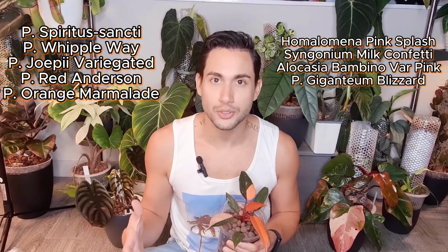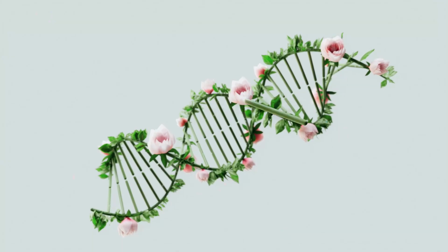In this video, I'm going to show you how I deflask tissue culture plants, what I do when they're contaminated with mold, and then how I transition them into LECA.